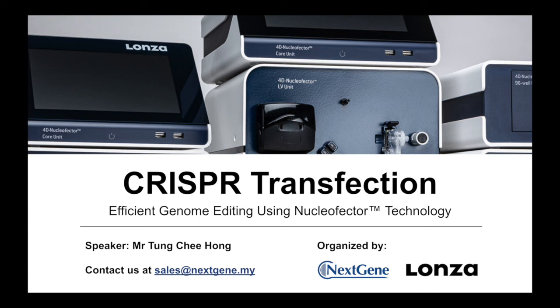So therefore, you can search in the Addgene site, looking for, let's say, plant CRISPR editing, and then look for the plasmid for plant editing purposes. For the delivery method, if I'm not mistaken, they use the Agrobacterium method. So you just use the suitable plasmid, put it into the Agrobacterium, and then use it to infect the plant. And hopefully the Agrobacterium can infect your particular plant organism.